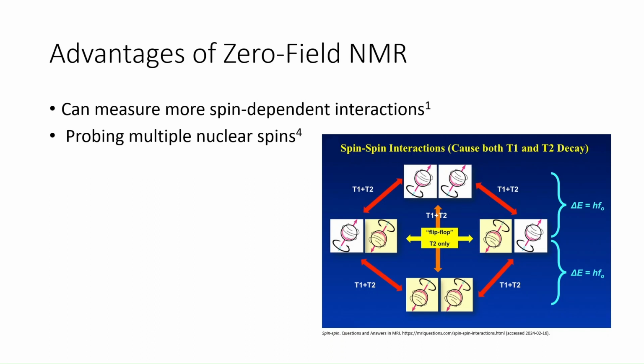The image here helps visualize some spin-spin interactions between nuclei and protons in either spin-up or spin-down positions, with various ways they can be spinning and the energy of those spins.